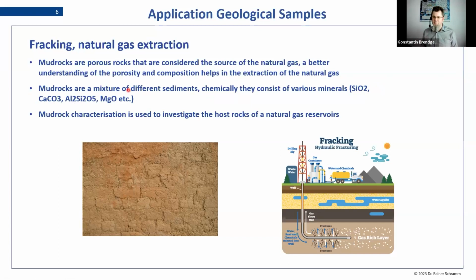So this is quite an intensive field of analysis, because people want to find out where it is viable to make these kinds of extractions, and they try to find the correlation between the composition of the mud rocks and the content of natural gas, for example. So again here, quite interesting samples that are analyzed.